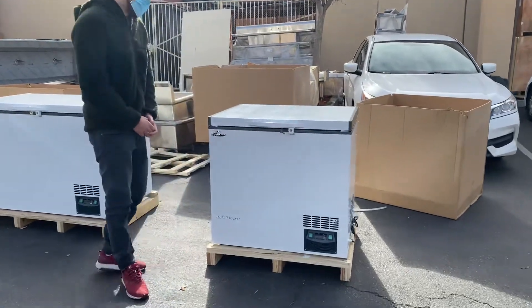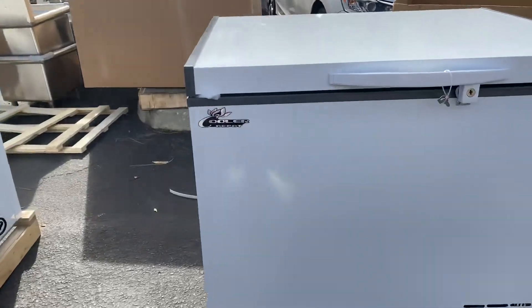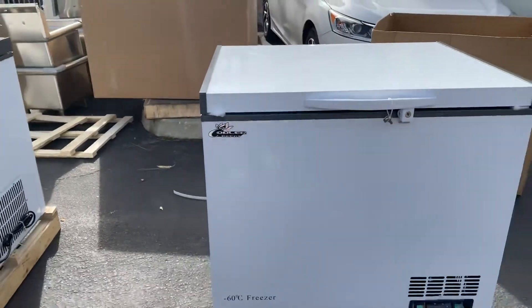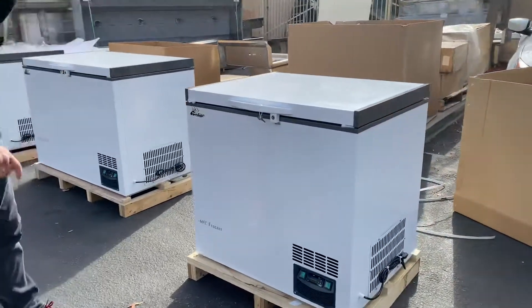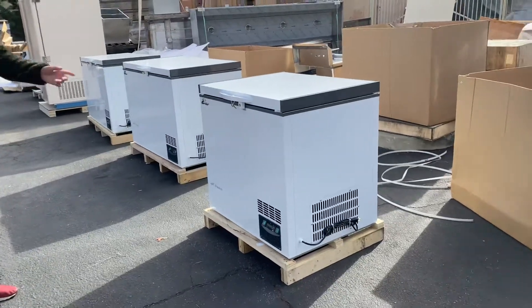Hello everybody, today we're going to demonstrate one of our brand new items. You're going to be looking at one of our seafood freezers. The brand on this unit is our own company brand, Cooler Depot. This is going to be our smallest size — we're looking at 188 liters capacity on the inside.